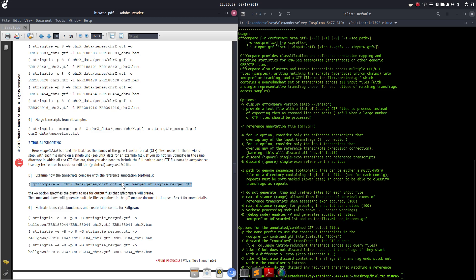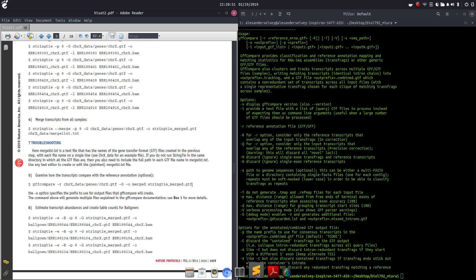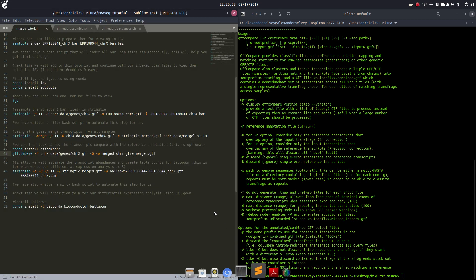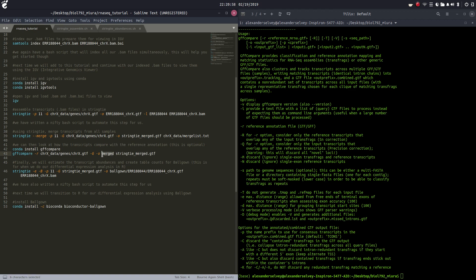So the dash-r is our reference annotation, dash-G tells it to compare all the reference annotations to our merged file. Dash-o means every output file that we get is going to start with 'merged dot something'. And then our input file is our stringtie_merged.gtf.